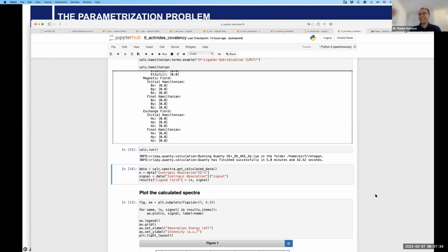Exactly. And the nice thing is you can do one analysis and you get the output, and then you can copy it in and simply get the Python script, or close to it directly, and then you can use it. This is what we are doing for quick stuff, for instance.